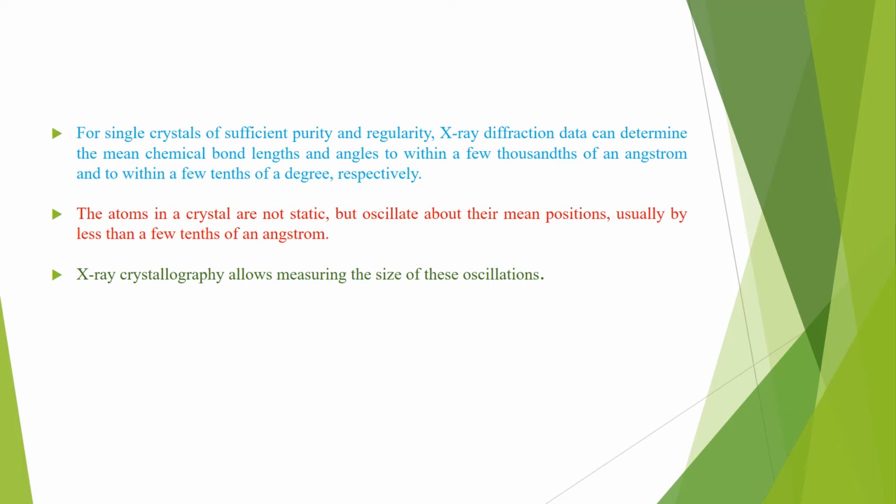And also we know that the atoms in a crystal are not static, but oscillate about their mean position, usually by less than a few tenths of an angstrom.